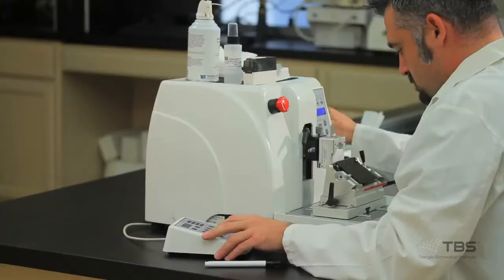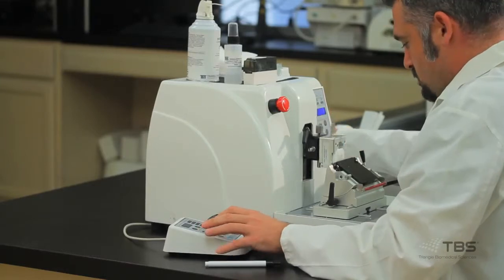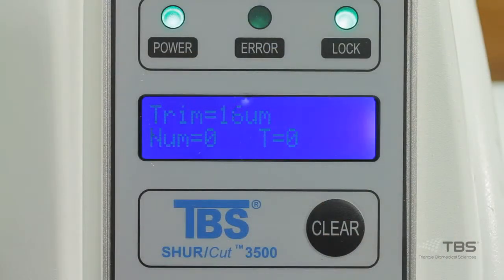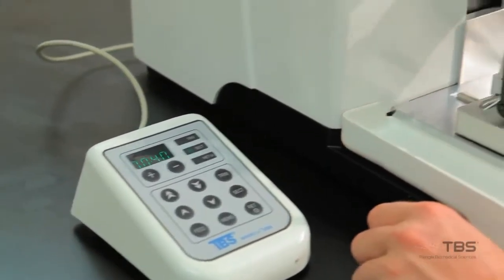To increase or decrease the thickness, simply press the plus and minus signs on the control panel. The specimen arm is easily advanced and returned by pressing the appropriate direction arrows. When switching from trimming to sectioning, the counter automatically resets.